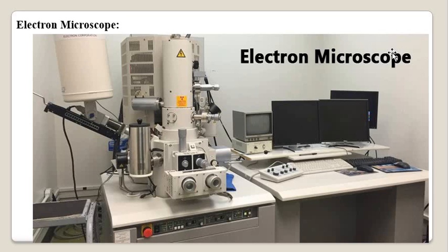In the compound microscope and in the simple microscope, light was used, right? But in this case, instead of light, what is used? Electrons, right? Very short wavelength electrons are used as a source of illumination. And it is a product of a large number of inventions and discoveries in physics.